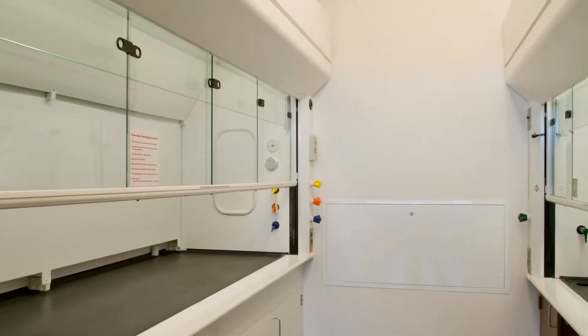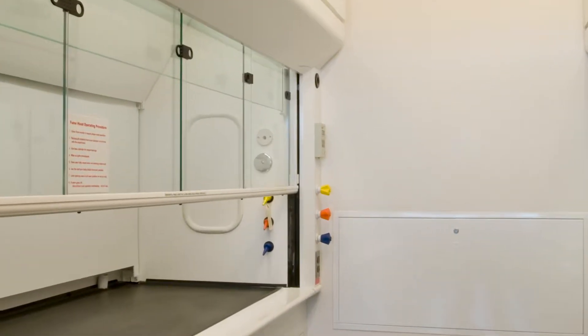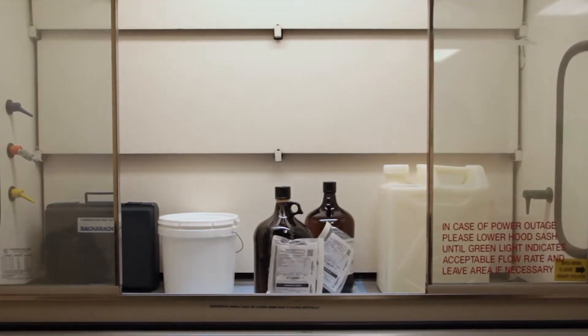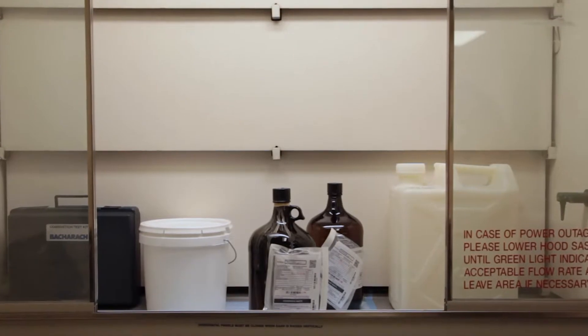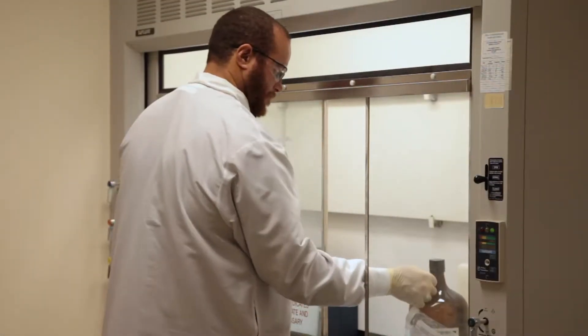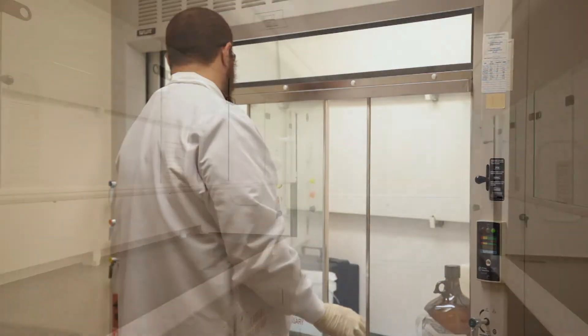Fume hoods are ventilated enclosures designed to trap airborne contaminants and chemical vapors and exhaust them outside the building away from the user and the laboratory environment. When used properly, they can be an effective tool to protect laboratory workers from chemical hazards.